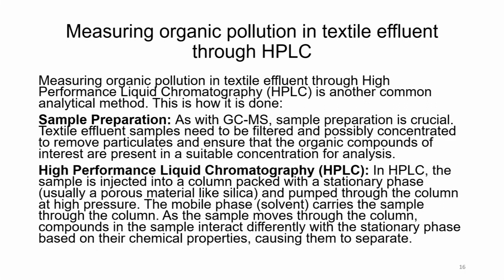Here also, just like GC, there is adsorption and desorption on the solid surface, and here of course it is not gas helium which is the carrier gas, but it is solvent which is carrying the compounds, and during their passage over the column they get separated due to the inherent nature of their polarity.